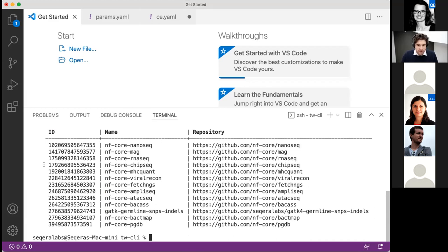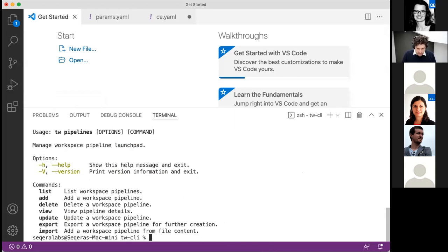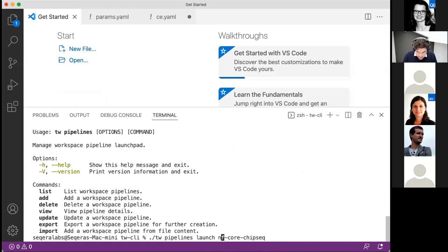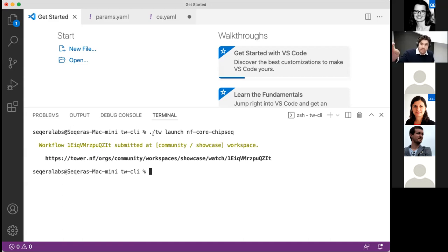If I want to launch one of these pipelines I've got a couple of different options. I can say 'tw pipelines launch' and choose the name or ID of the pipeline I want to launch. Let's launch NF-Core ChIP-seq. This is the interaction taking place — we're submitting that pipeline and saying 'launch that pipeline with Tower'.